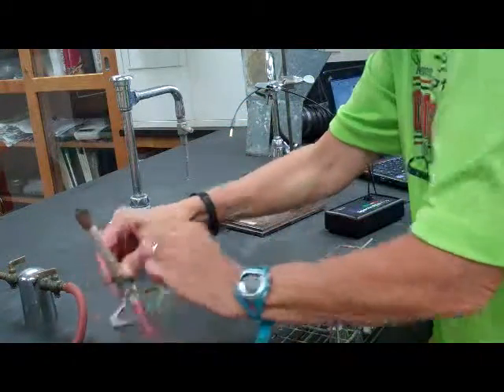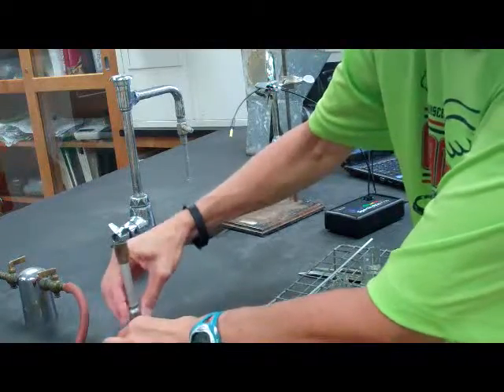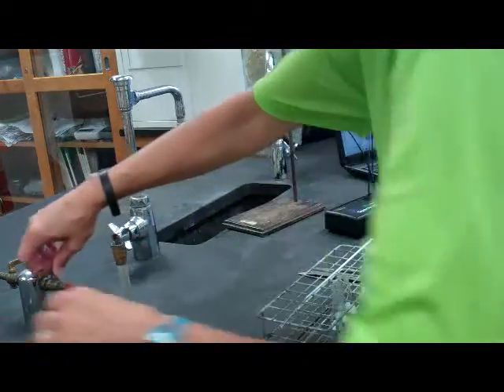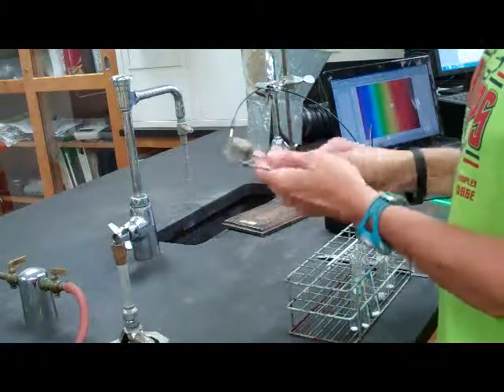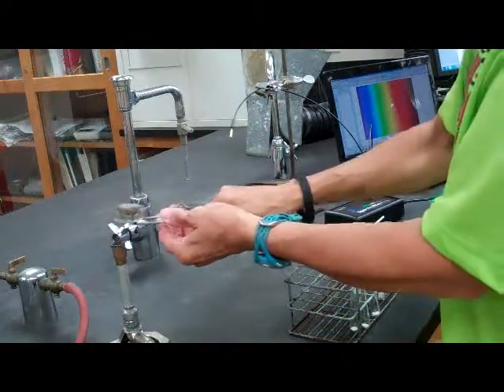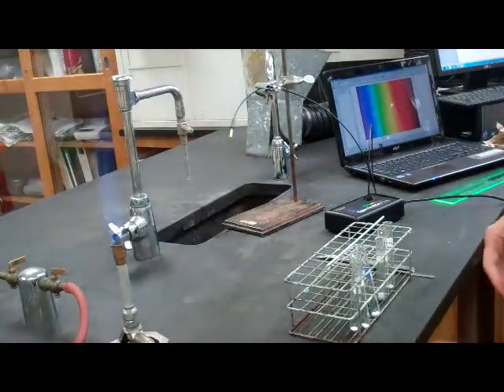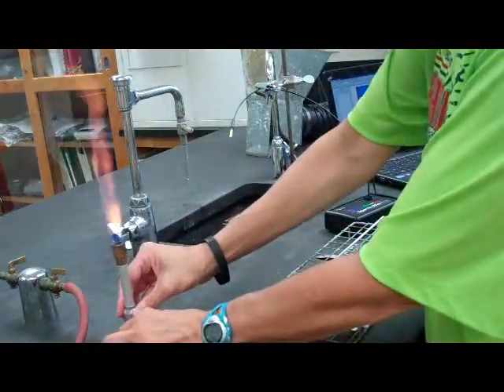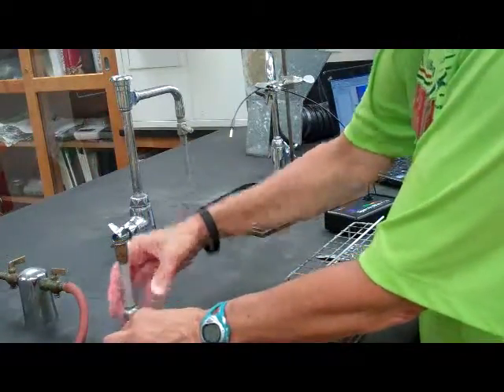Remember, you want to have the needle valve open, you want to have some oxygen in as we loosen up the barrel. Hear a nice stream of gas, have our flame starter. There we go. Our next direction says we should turn this flame down a little.